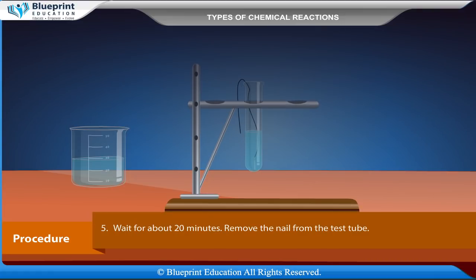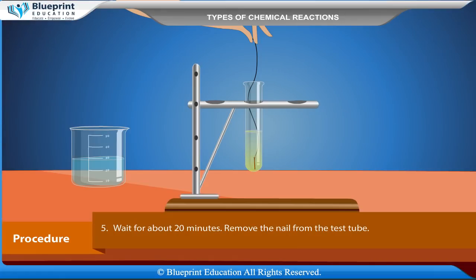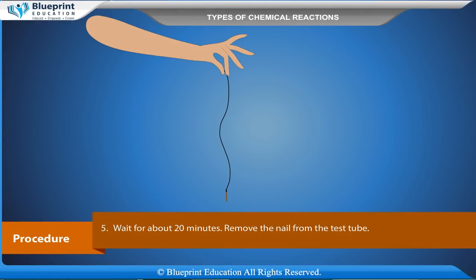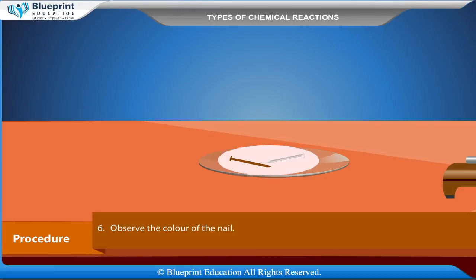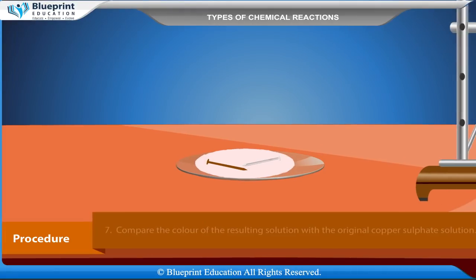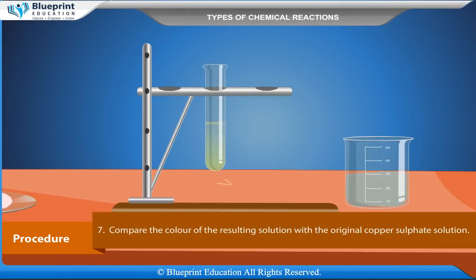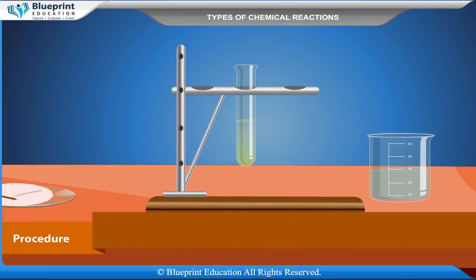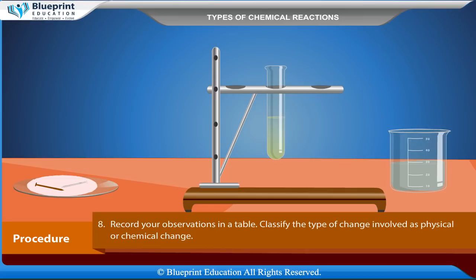Wait for about 20 minutes. Remove the nail from the test tube. Observe the colour of the nail and compare the colour of the resulting solution with the original copper sulphate solution. Record your observations in a table and classify the type of change involved as physical or chemical change.